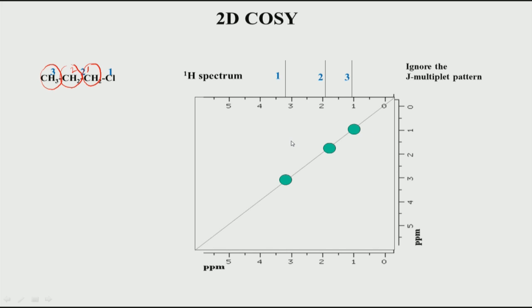So, one of the areas of research in NMR is to have a diagonal-less homonuclear experiment. There have been a lot of papers published where scientists have tried to get rid of this diagonal, but remember it is not very easy, because this behaves like magnetization. You cannot distinguish in NMR between what remains on itself and what is transferred to somebody else, both look the same. So, how do I selectively suppress or remove the diagonal, but keep the transfer information? That is called the cross peak.